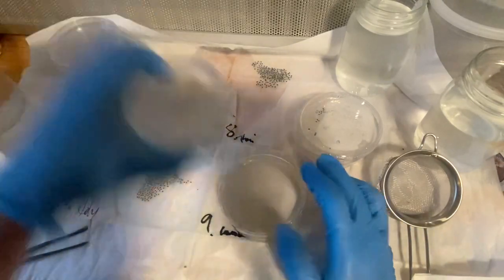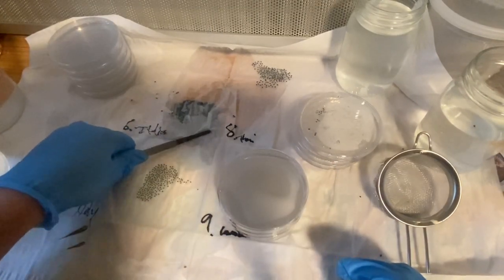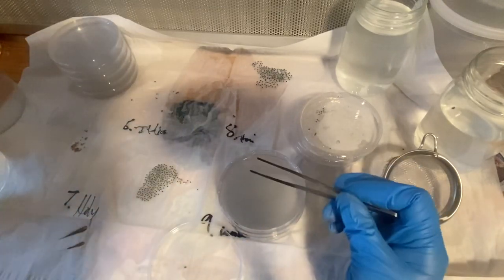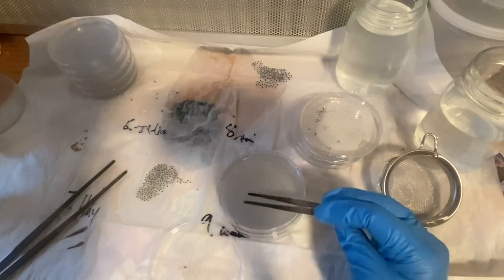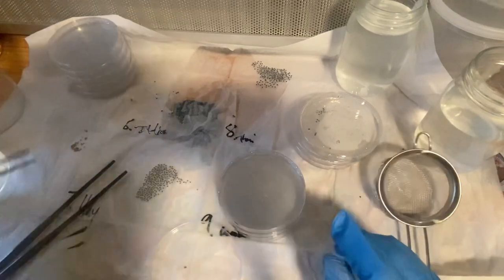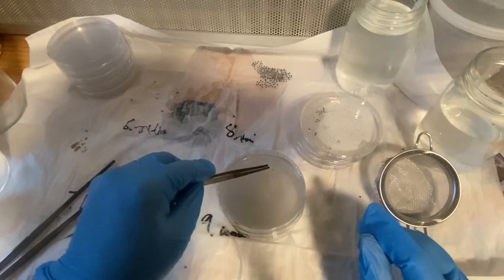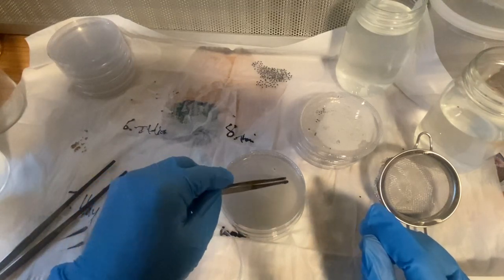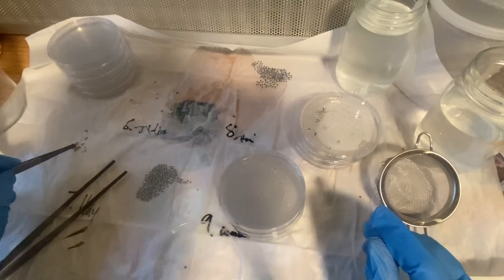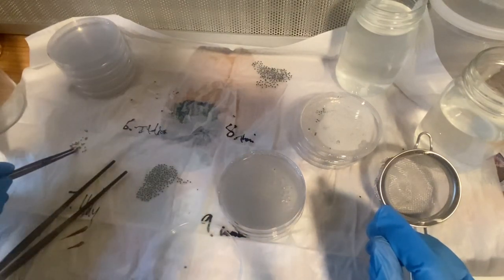Alright, and I'm going to go ahead and put my lavender seeds now on here. Make sure my tool's cool. A little hot. It's okay. Cool it down. Alright, so do what I normally do, where I get the agar on my tool, just to start slowly separating these seedlings.